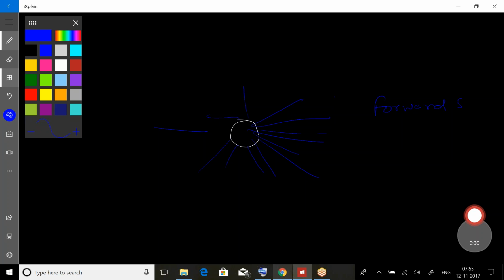The term comes as forward scatter, and in some instruments it is written as FSC. Some people also refer to it as low angle scatter. No matter what, we are talking about the Mie scatter generated from the particle. And in flow cytometry, one way people describe it is that it tells about the relative size of the cell. However, this is not universal.